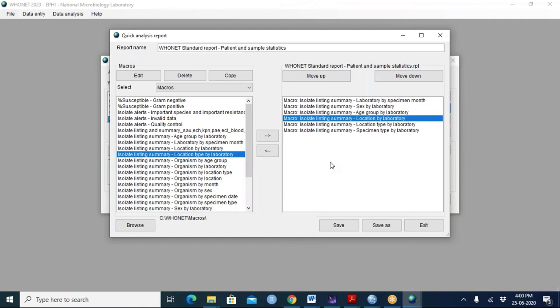Both of them are correct, but it just makes it harder to combine the data. So we could discuss that later as a potential issue, so that we want all the hospitals to be as standardized as possible for the things that we care about. If there are things we don't care about, if one has diagnosis and the other has the name of the doctor and the other has the urine colony count, that's not part of my national protocol. I don't care if that's standardized. But the things I do care about, I do want that to be standardized.